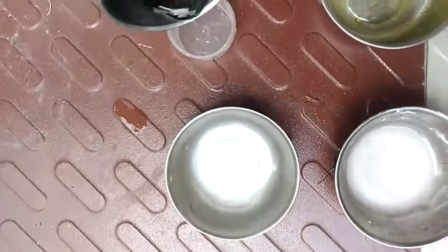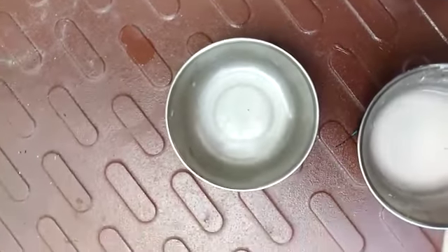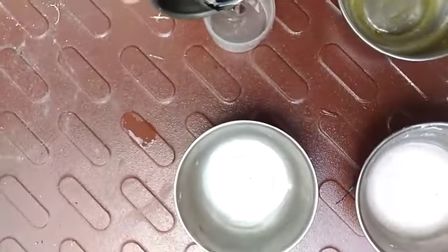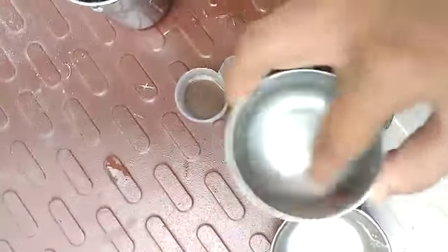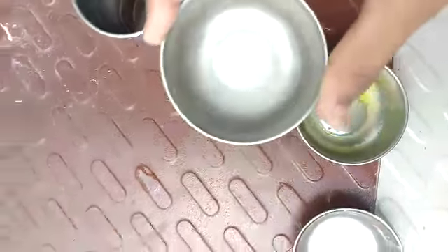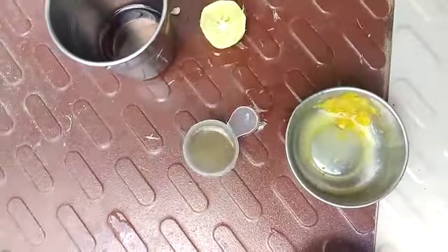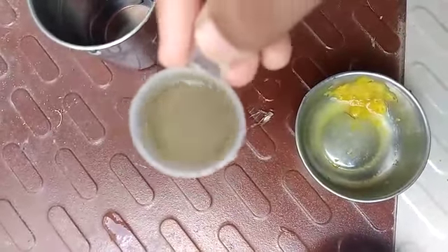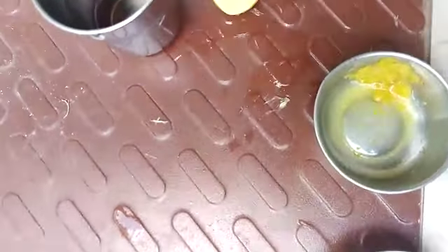Now we will put the indicator again. Now we will put lime water in it. Take some lime, mix it with water and the lime solution will be ready. See, as we put the lime water, the color changed to green. It shows that lime water and lime is a base.